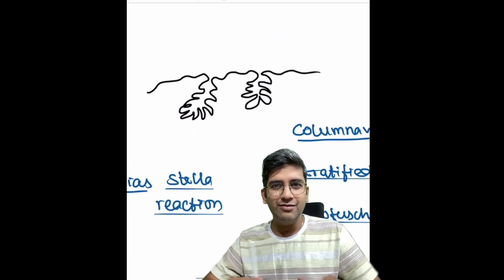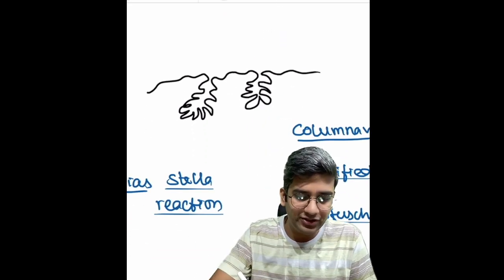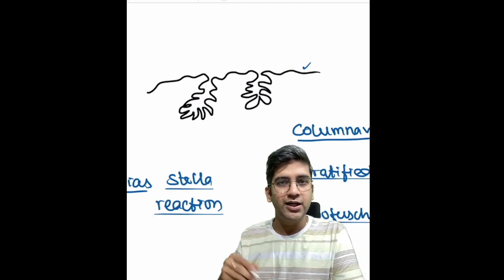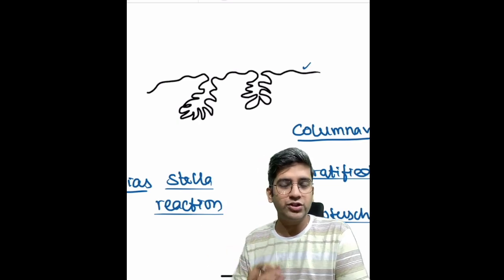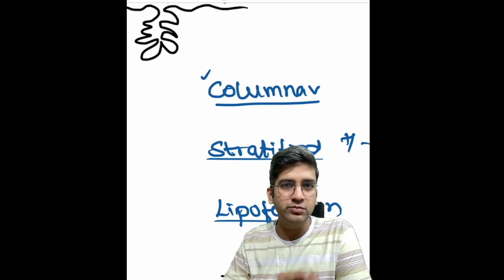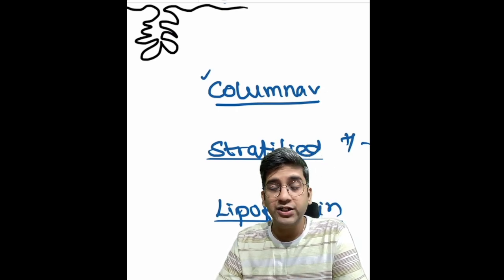Seminal vesicle is a very multilobulated tubular gland, right? If you can see the surface epithelium like this, it'll be extremely convoluted, kind of like a papillary appearance, like an acne with lots and lots of convolution. That's how a normal seminal vesicle looks. And I can see it's lined by a simple columnar epithelium. Stratification might be seen, right?